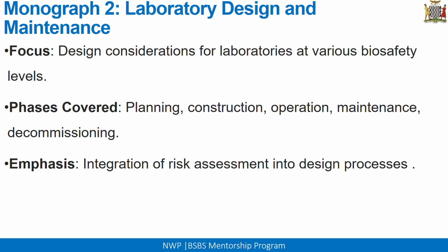For example, how do you plan for your laboratory design? How do you construct the laboratory? How do you conduct certain operations as you are planning and designing for this laboratory? How do you do maintenance of particular equipment in the laboratory? For example, how do you do maintenance for your biosafety cabinets or any other containment devices or equipment? And also, how do you decommission some of the equipment?